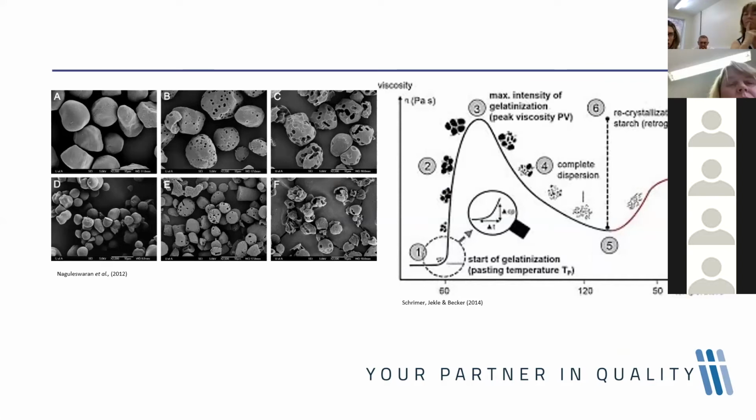The sample there, which is indicated A, shows you what an intact starch granule is. B and C show you what the effect of alpha amylase is physically on the starch granule.